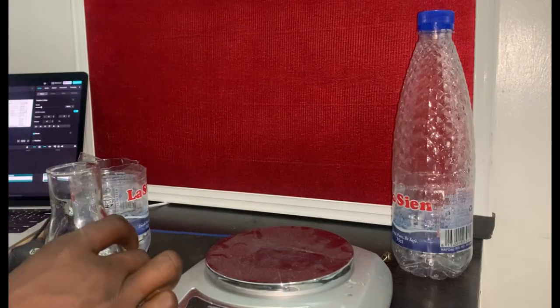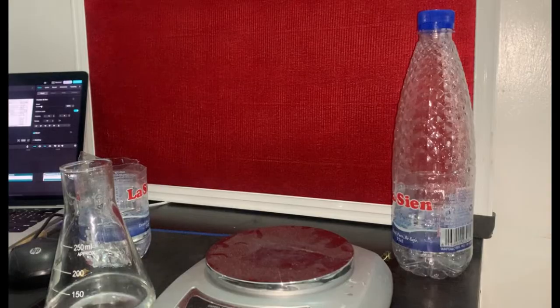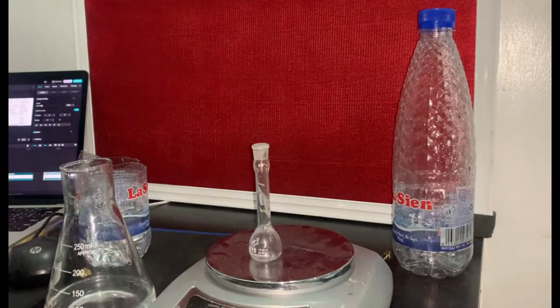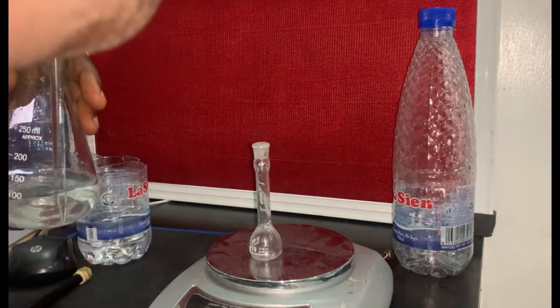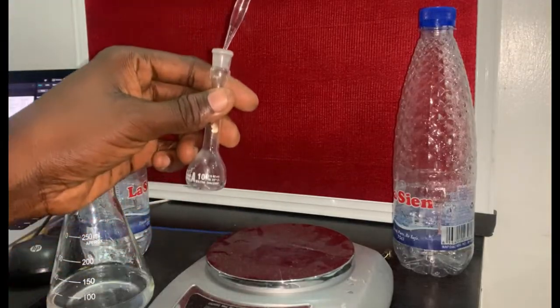I come here, right? Basically, 1 minute. So I'll come here, use my pipette and take out 10 ml from here. After mixing it thoroughly, I'll take out 10 ml from here, right? And fill my volumetric flask.